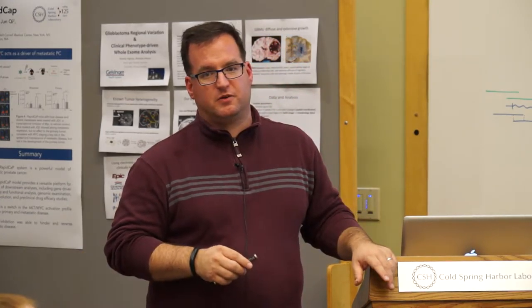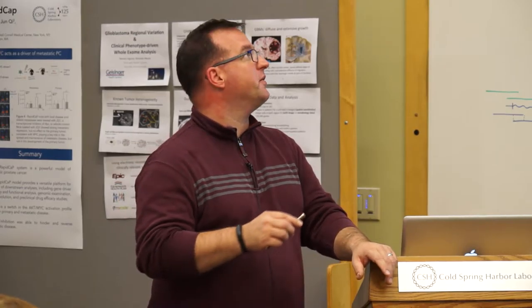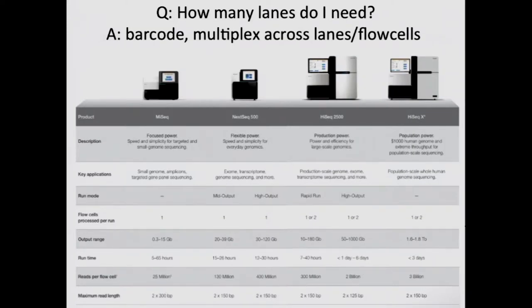Now every core lab or vendor who's going to do the sequencing for you has the capability to barcode every one of your samples for pennies on the dollar. So if you have 20 samples, you give them 20 samples, and they put 20 barcodes on them. Then the question is really just how many reads per sample do you want? Do you want 10 million reads? 50 million reads? 100 million reads? Depending on how many reads you want, and on what machine they have, the sequencing core is going to spread it out over however many lanes they can or need to satisfy your request. So it's not so much of an issue anymore for most modern labs.